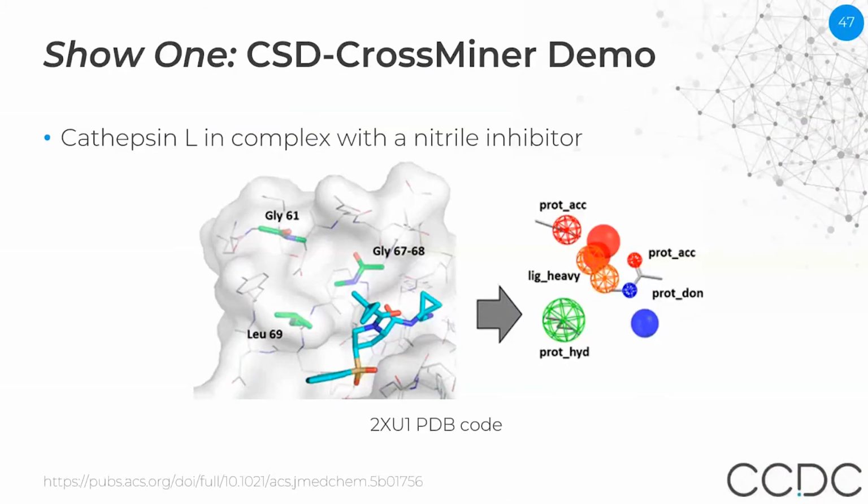So I think it's my turn now. Thanks, Ilaria, for the nice overview of the GUI. For the demo today, I'm going to use a Pharmacophore query generated to describe the S3 pocket of the human cathepsin L protein in a complex with the nitrile inhibitor, as displayed here.